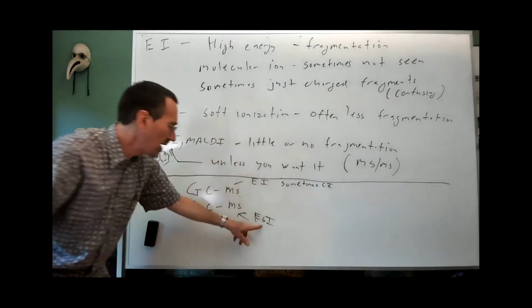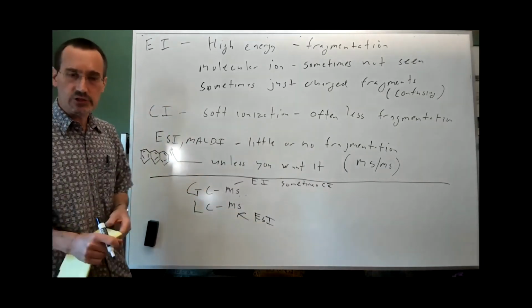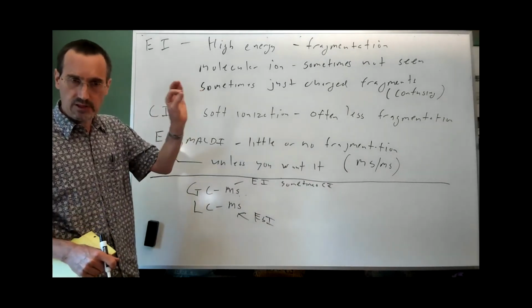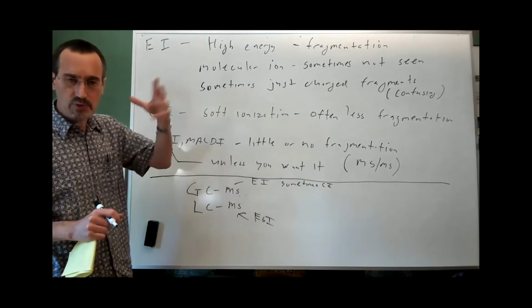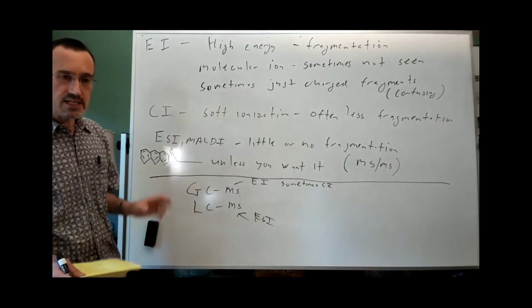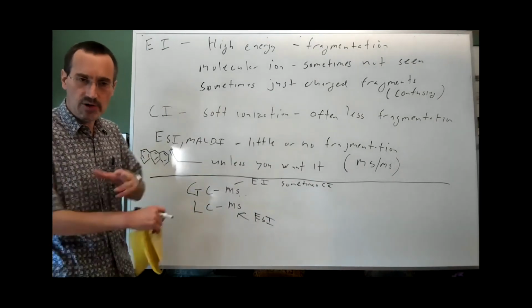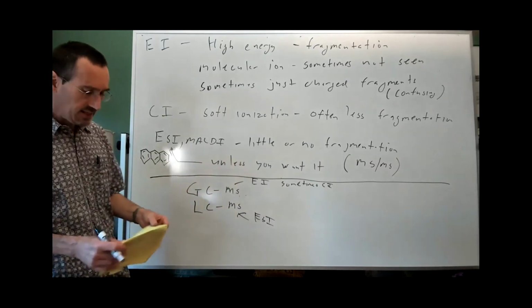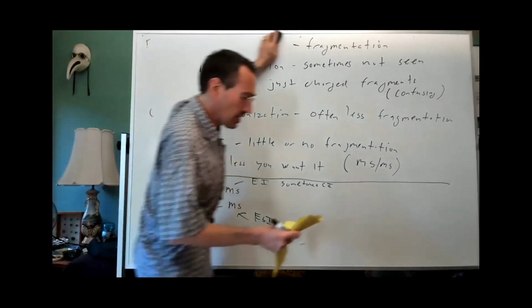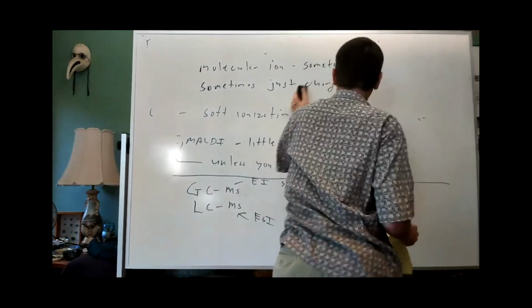It works very well coupled with electrospray ionization because you basically just spray a small amount of your eluent through an electrical ionizer and evaporate the solvent and get it into the mass spec. So that's another useful technique where you get sort of a second dimension, a chromatographic time dimension to separate your molecules. Anyway, so this is a collection of sort of basic techniques.